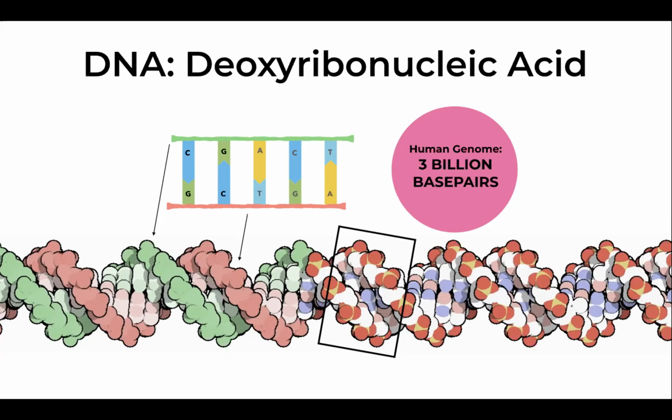So what we'll do in the program is, first of all, go through some of these introductory things to refresh everybody's memory and understand what are we dealing with. When we say genomic, how is genomic different from any other kind of omic? What are some of the technologies that are used to sequence this kind of data? What are some of the analysis methods? And what are some of the challenges that we are trying to solve when we analyze, process the data, annotate the data, and try to interpret this data in the context of a biological question?